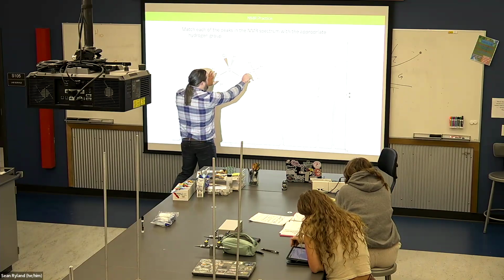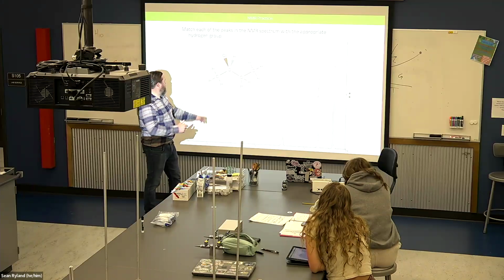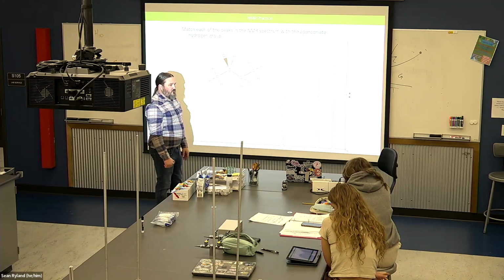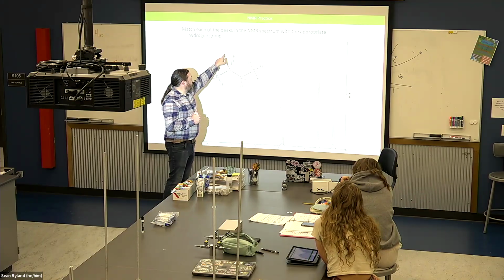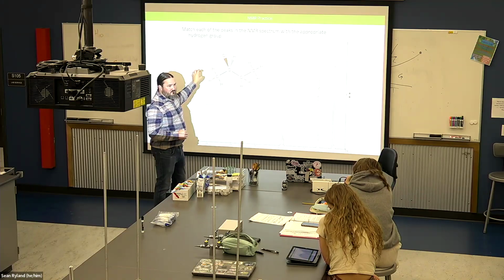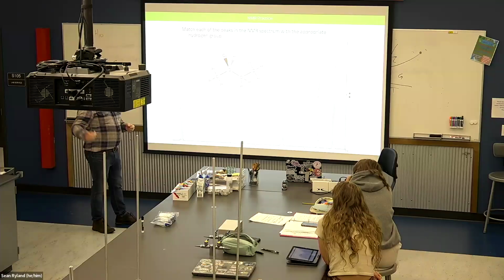But then just looking at, without even looking at peak splitting, which of these should be more deshielded? Deshielded is most partial positive of the 2 methyls. So furthest to the left. That's this one. Yeah, it's closer to the chlorine, so it's more deshielded. The chlorine is stealing more of its blankets. Right, that's really what we're talking about, shielded and deshielded. Shielded, they have all the blankets. Deshielded, something is stealing their blankets.